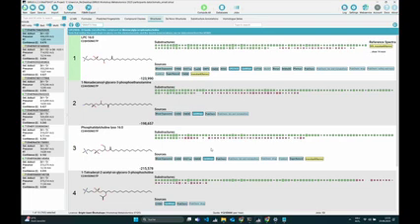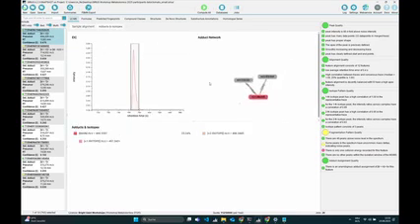Okay, but there is no way right now to add, for example, one mzML file, and then compute the whole SIRIUS and then add it to the... Yeah, sorry. I'm not sure if it's in this version that it already works for multiple charged ones, but in one of the next versions we will at least find them in the preprocessing and add them to the project, but skip them during annotation. And in the preprocessing view, you can then also check whether they are grouped together, like in the adduct network.